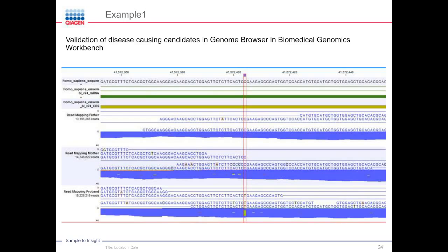So they're all in blue, which means that they are mapped unambiguously. So there was just one position where these, so it was not a homopolymer region or anything. You can also see that the reads were aligned to each other because they are blue in a distance which was expected. So overall, this is a really great candidate, and also by just looking into the map sequencing reads, we can validate that this seems to be a true positive and not a false positive.